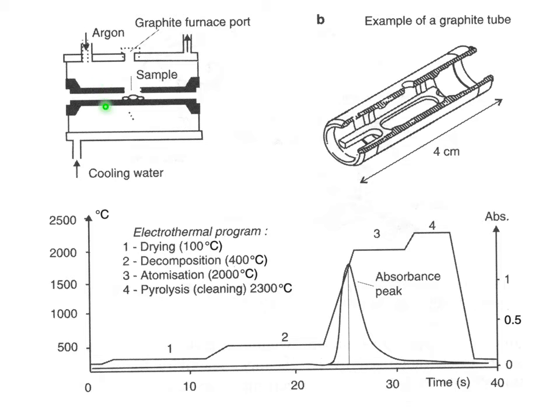we start heating it. How can we heat it? Graphite conducts electricity, and it can sustain temperature all the way to 3000. So when current is going around this tube, it heats very quickly because your sample and the tube are very small, and you quickly reach high temperature. So at first step, after you introduce your sample, how much you introduce? Say 10 microliters, not more. So it's much less than 1 drop. First you dry it at 100 Celsius. It will take a couple of seconds.